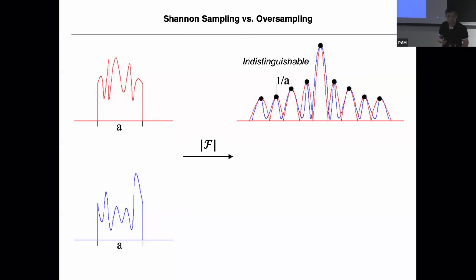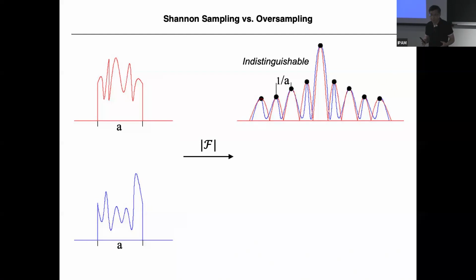But in crystallography, how much does it matter that the crystals you have may not be a single grain of salt? You might have a dozen grains of salt. Do you count on the fact that they are somehow aligned? Yeah, that's a good question. In older days, you needed large crystals, but now the X-rays are more powerful, so you can use very, very small crystals. The crystal has to be well aligned.